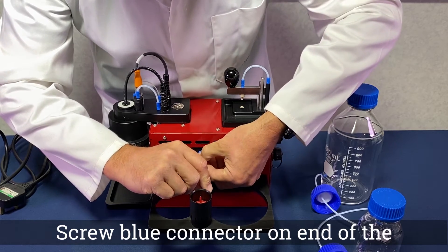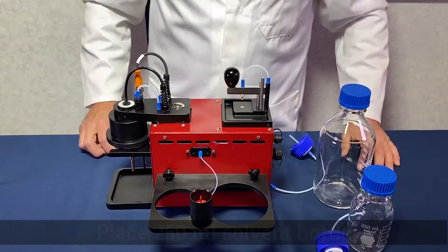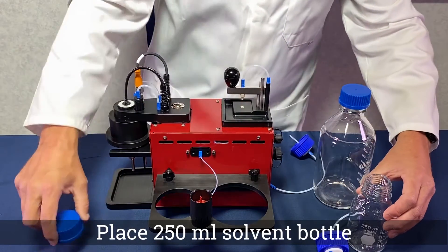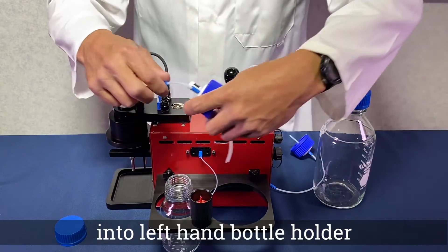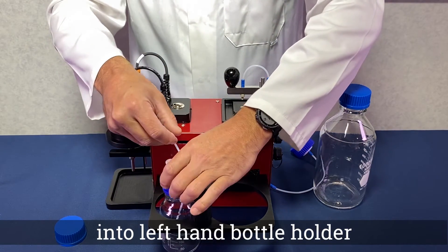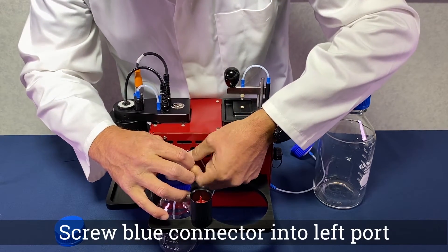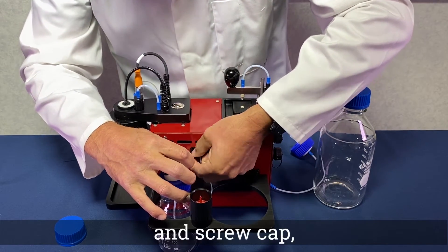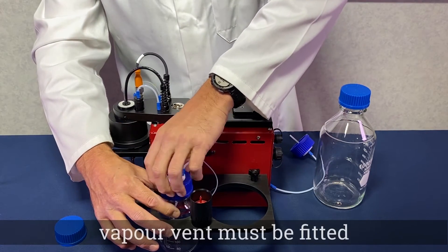Screw the blue connector on the end of the dyed water tube into the middle port. When looking from the back, place the 250 millilitre solvent bottle into the left hand holder. Screw the blue connector from the solvent bottle tube into the left hand port. Ensure the cap is tight and the vapour vent is fitted.